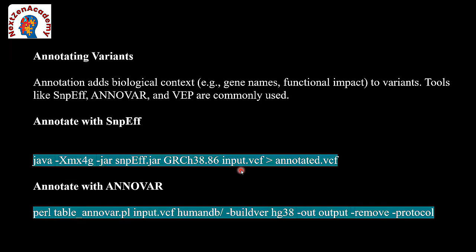Then, how to manage the VCF file format. This is the output of the called variants and how it looks. The VCF file has header sections with meta details about the file content: reference genome, version, sample name and filtration.